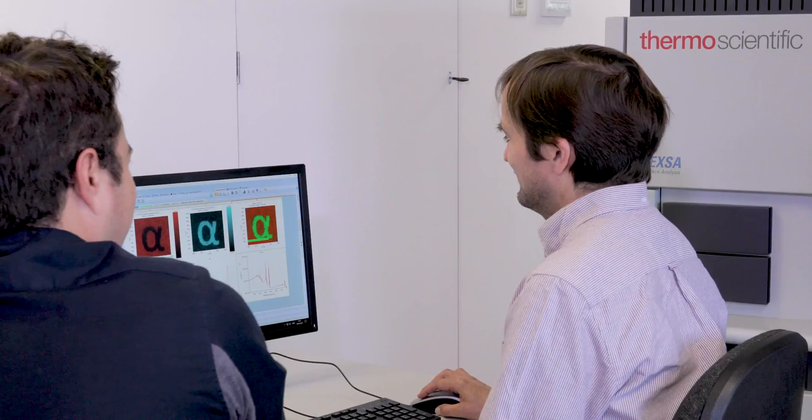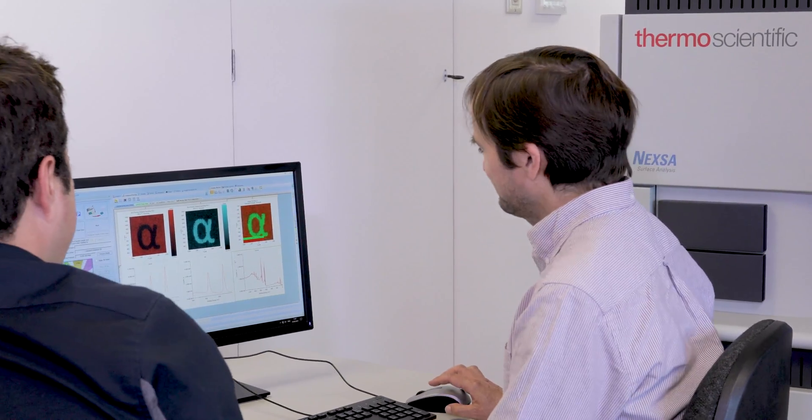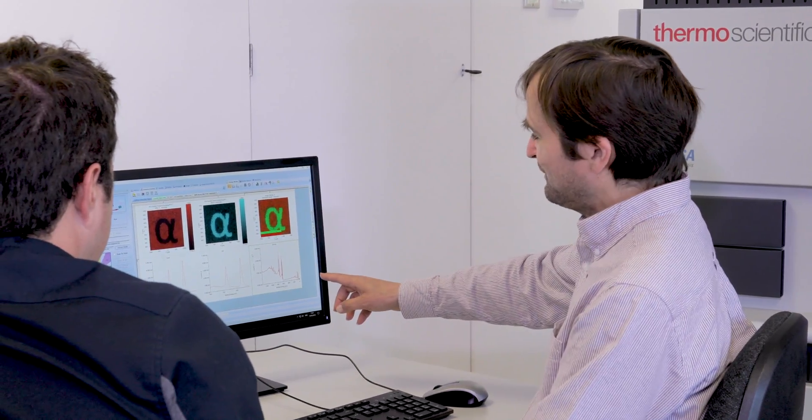Simultaneously, snapshot spectra are taken at every pixel point. In the Avantage software suite, SnapMap not only enables users to take rapid XPS images, but positional information can also be taken from these images and used for subsequent analysis.